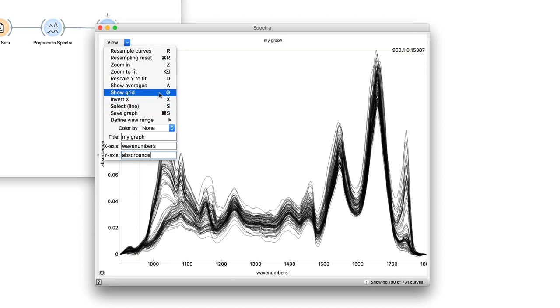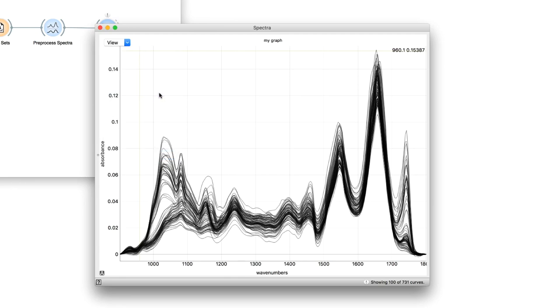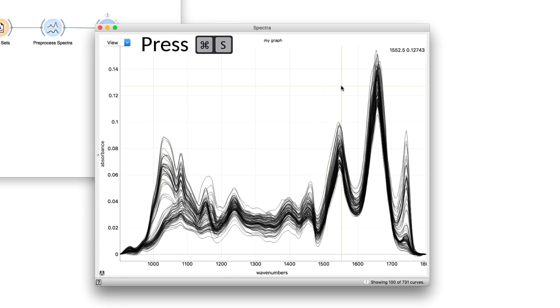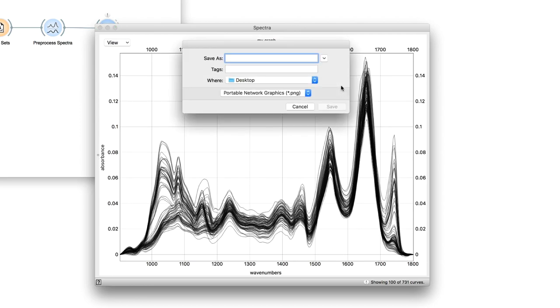Do you like the visualization? Why not save it? And import it into a presentation or a manuscript. There you go!